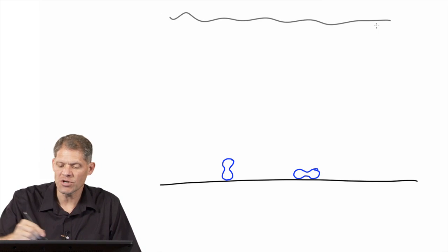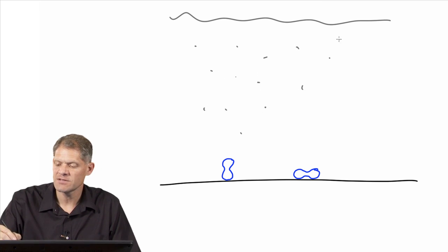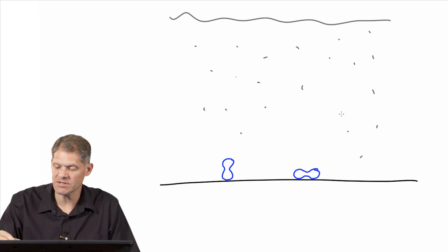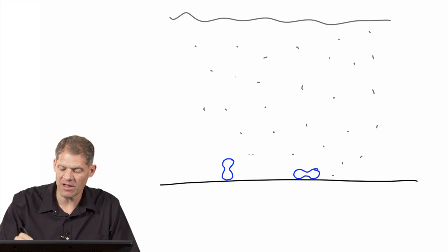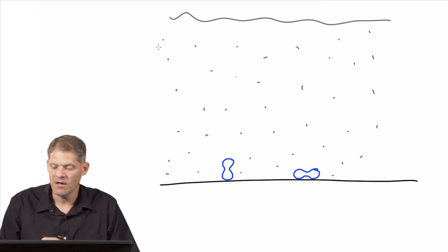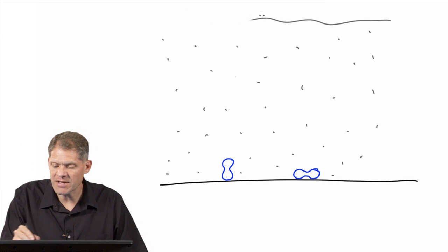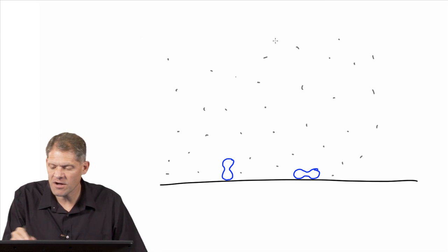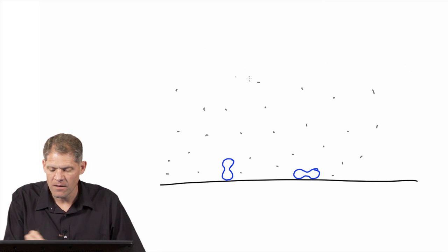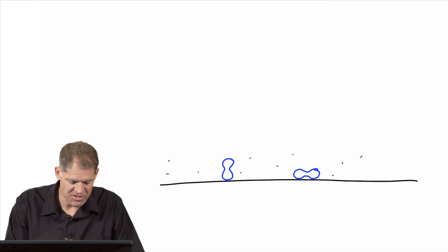They're in a solution that has a lot of metal ions in it, say uranium, for instance, if this solution is uranyl acetate. And so the uranium is dissolved in this stain solution. And as that solution evaporates, the metal ions are concentrated to higher and higher concentration in the thinning layer of fluid until eventually they precipitate.